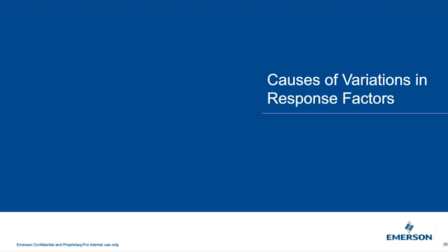Okay, so we've made it through half the presentation, and I just want to try to catch up very quickly on some of these questions and see where we are at. One of the questions is, what effect does response factor deviation have on retention time? For example, the slide showed an RF deviation of 0.6 and a retention time deviation of 0.